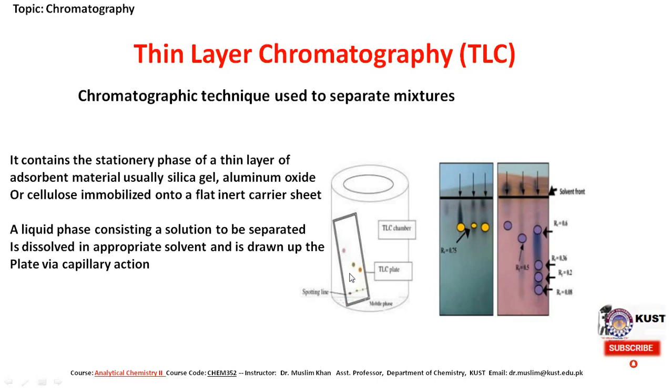So the advantages of thin layer chromatography are that it is a simple process with a short development time. It helps with easy visualization of separated compound spots. You can see them. The method helps to identify the individual components easily. It helps in isolating most of the compounds. The separation process is faster and the selectivity for the compound is higher. Even a small difference in chemistry is enough for clear separation. The purity of the given sample can be assessed easily. It is a cheaper chromatographic technique.